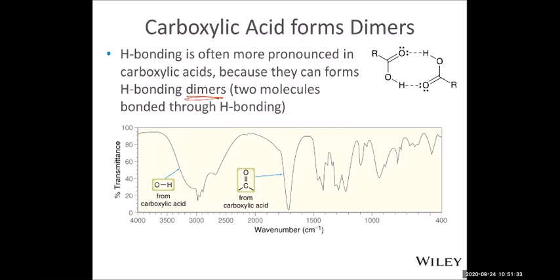The vibrations in a single molecule. So all these molecules' vibrations, they all show us signals. Even though the pattern is different, their frequency can be similar, and oftentimes the signals are close together, close to each other.